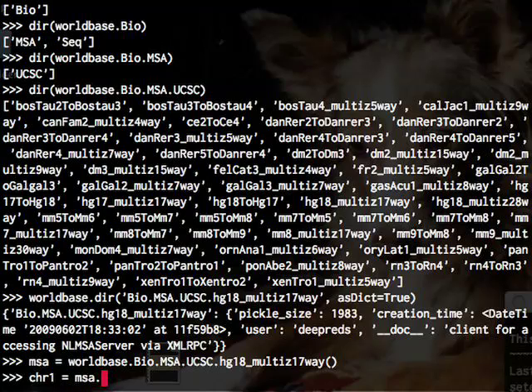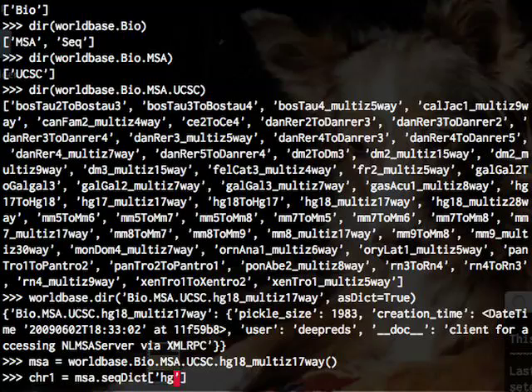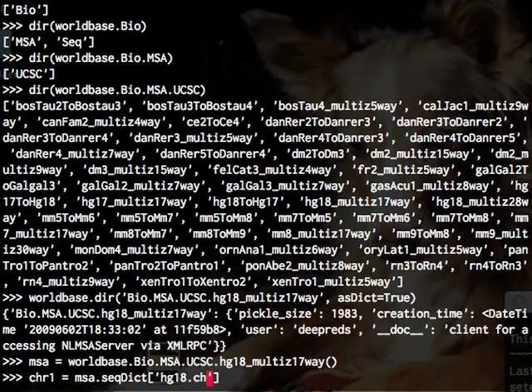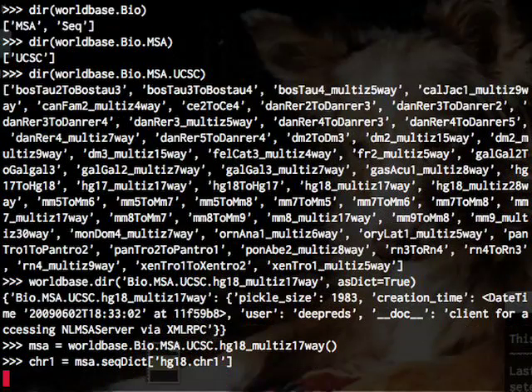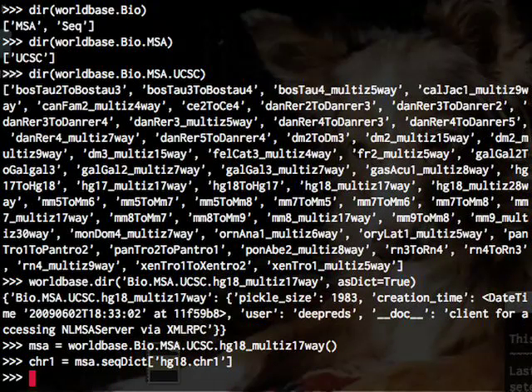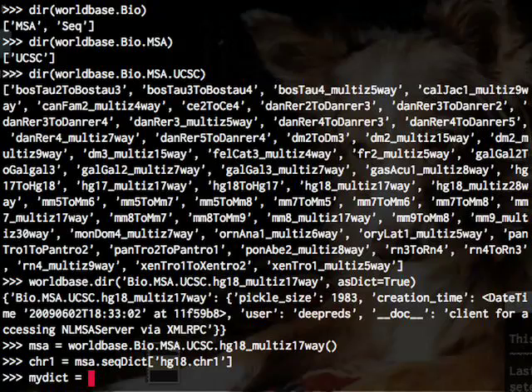So now we can start using this data. This is a simple example of simply pulling out chromosome one of the human genome from a 17 vertebrate genome alignment. This is a data set that's probably maybe half a terabyte in size.